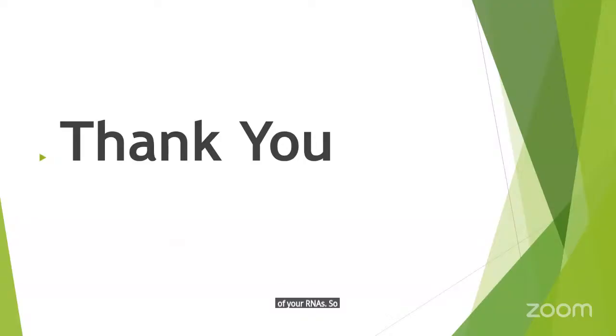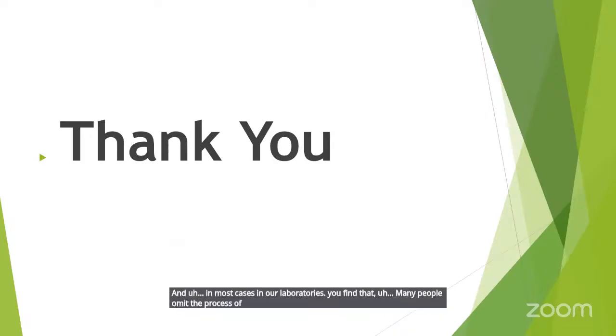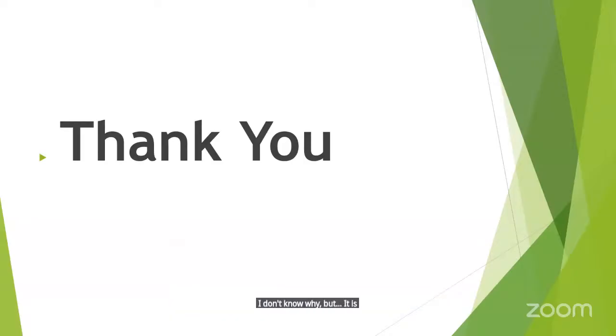So I think that comment is good, and in most cases in our laboratories, you find that many people omit the process of RNA extraction. I don't know why, but it is good to actually learn more about that. Thank you. I hope I've answered. Yeah, thank you, Mr. Rono. Let's look at other questions that are coming in.